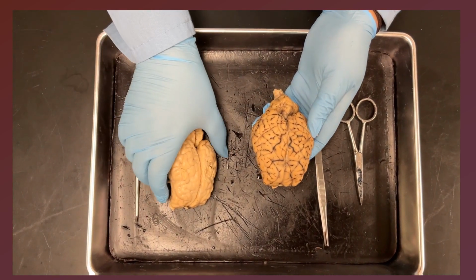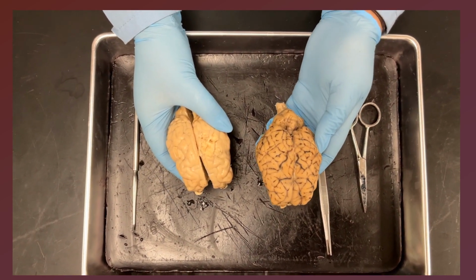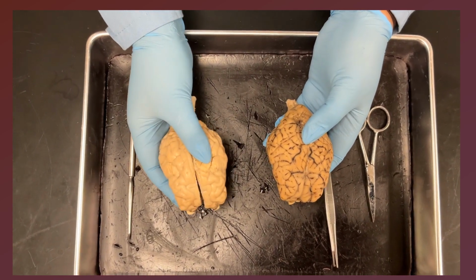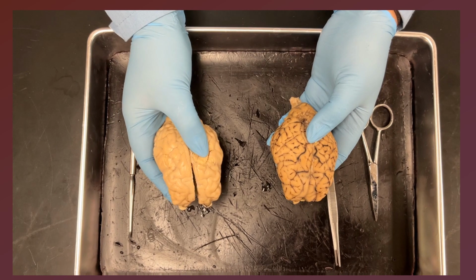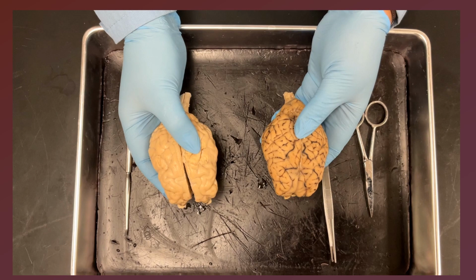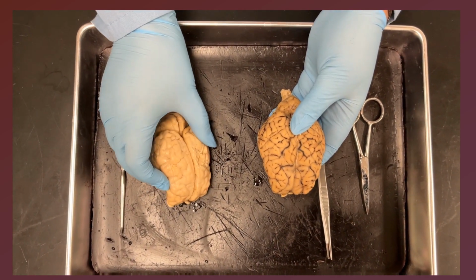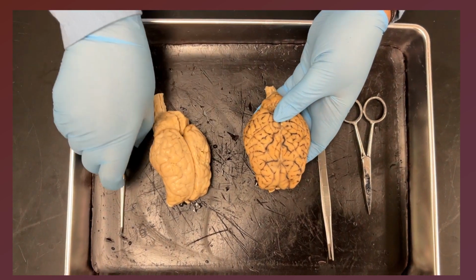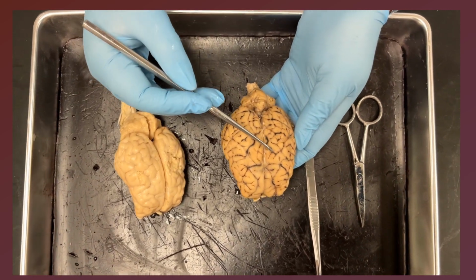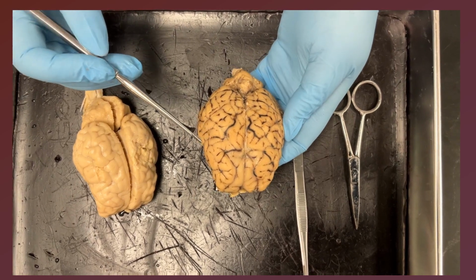See here, I have 2 different specimens. On my left hand is the first specimen which I'm working on, and this one I dissected before. Depending on how long the specimens are sitting in the preservative and how we get them from the supplier, they might look a little different. On these specimens, these darker colored areas are mostly due to the blood vessels.